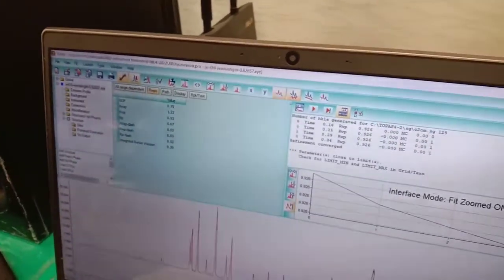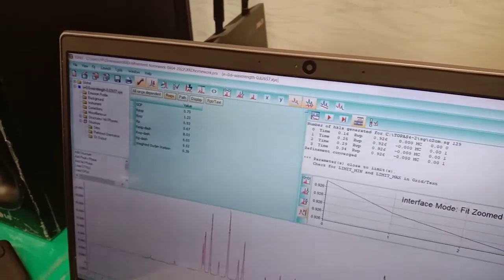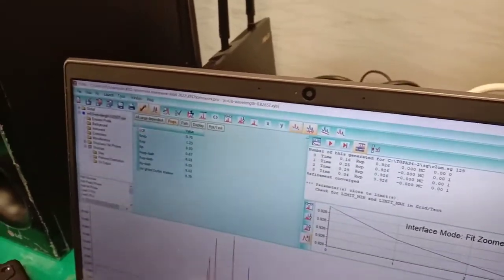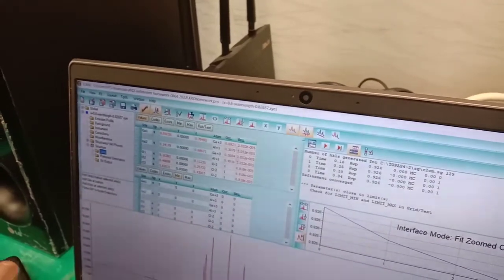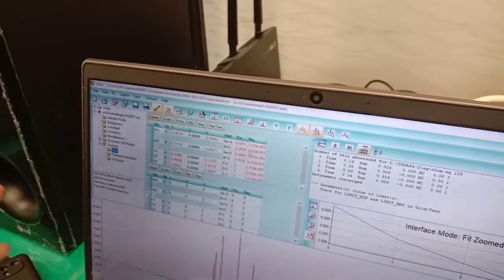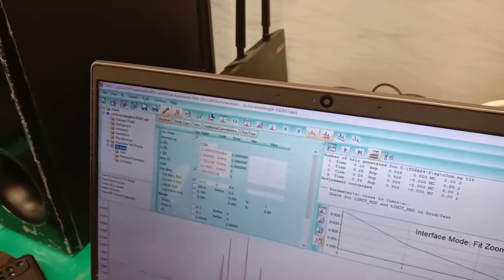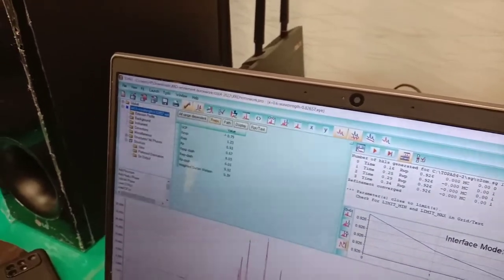Normally it's not good. We normally recommend it, but GOF is not a very good parameter to check. If I don't know whether my OCC value is right or wrong, I can check the OCC and then have an idea whether it's right or wrong. That's why you have to check your refinements.